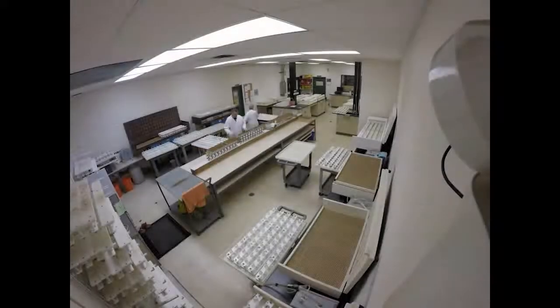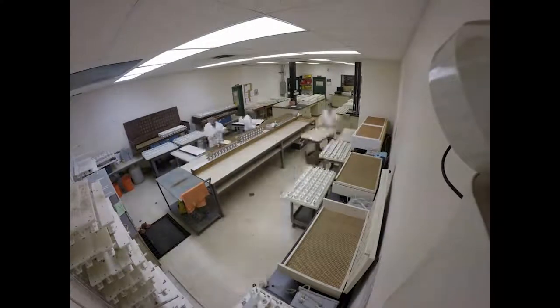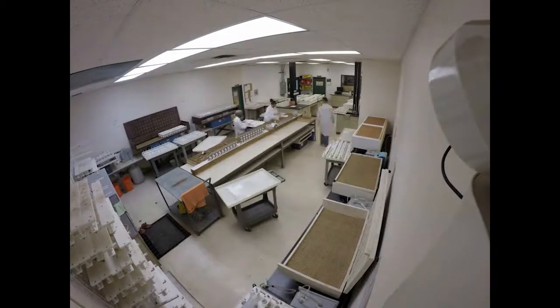After sample grinding, work in the lab can begin. The evening shift uses batch sheets to organize the first step in lab analysis. Here, technicians are scooping the small weights of each sample that will be used the following morning during the extraction process. The samples are grouped by analysis type using a batch sheet generated automatically from the LIMS.